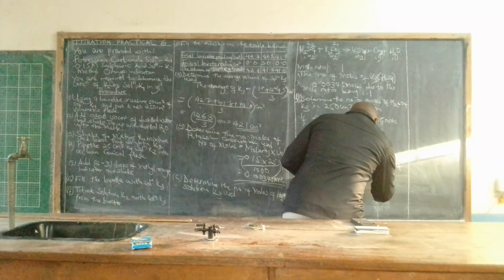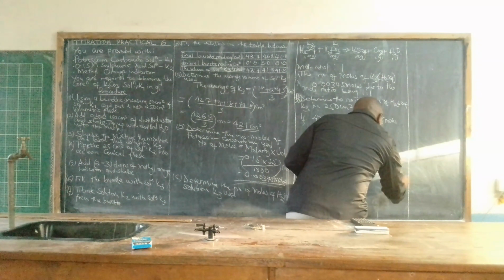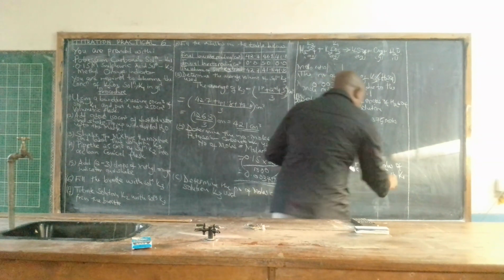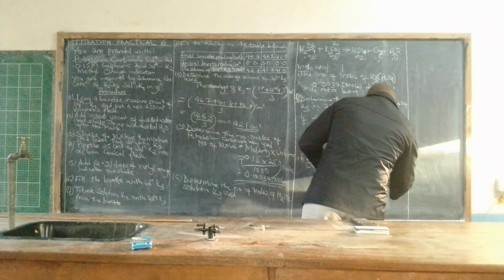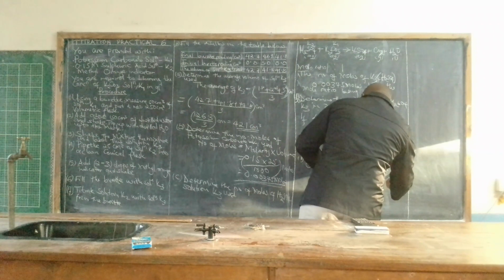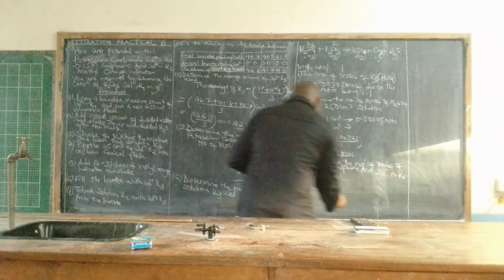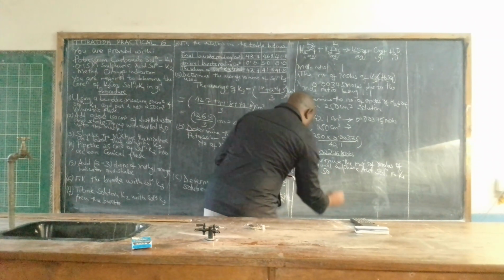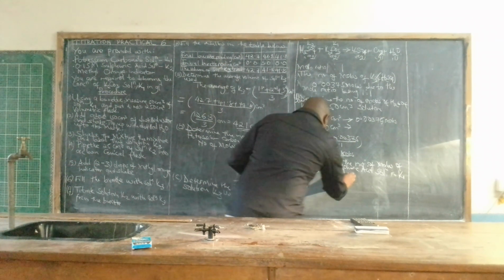Remember it's the original sulfuric acid solution K1 in 50 cubic centimeters solution.